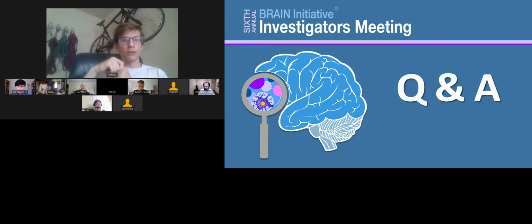And there's very little dead time in this case, because if you have lots of ROIs open in the field of view, most of your time is spent measuring an ROI. So if you think of the time efficiency of this type of measurement, which is the important criterion if you want to talk about how many different ROIs you can measure, it's very good and much better than the access times that you could get with AOD type scanners, because the access time becomes the laser repetition rate in some cases.